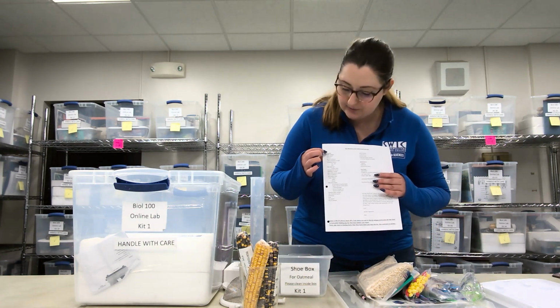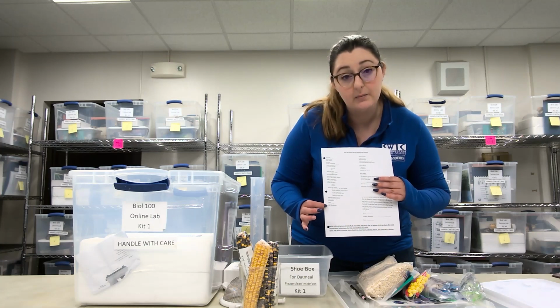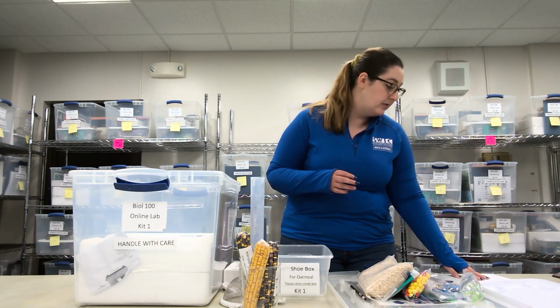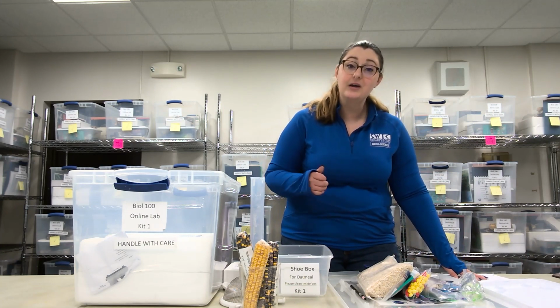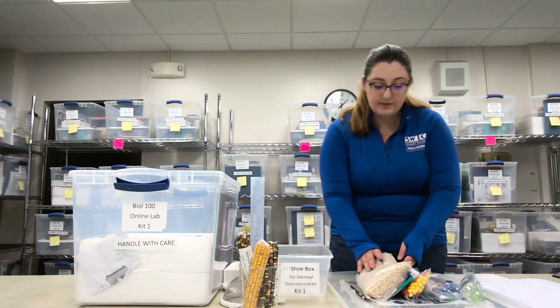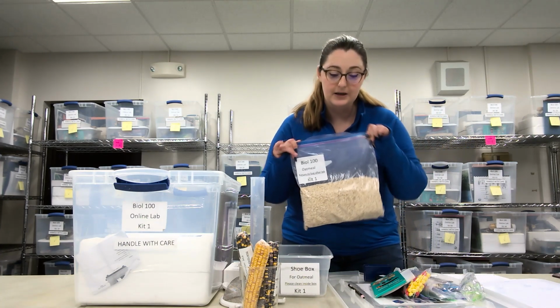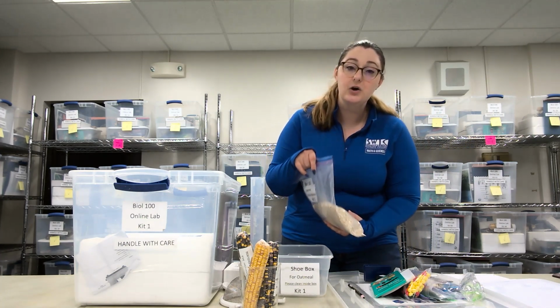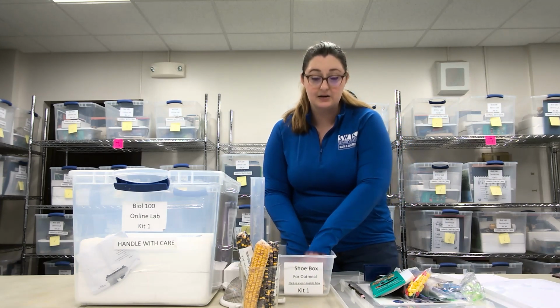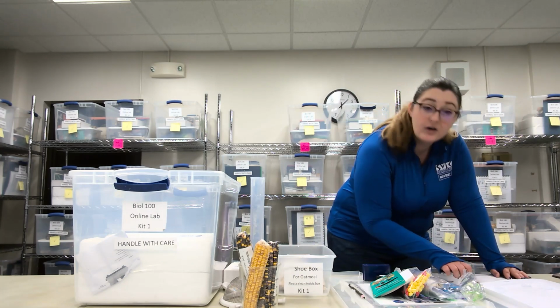So I am going through the items underneath shoebox, but I'm going to start at the bottom and work my way up, okay? So make sure that you know that we are starting with the bag of oatmeal and working our way up the list. So, bag of oatmeal. It is going to be this bag of oatmeal. Make sure that after you've used the oatmeal in the lab that you put it back into this bag and back into this box. Go ahead and check off your bag of oatmeal.